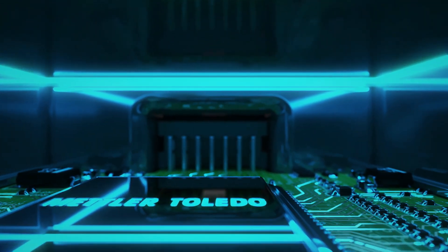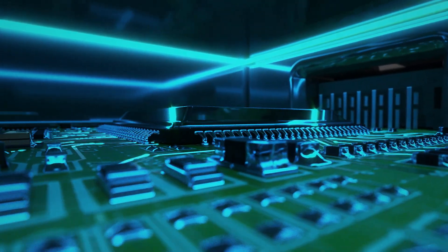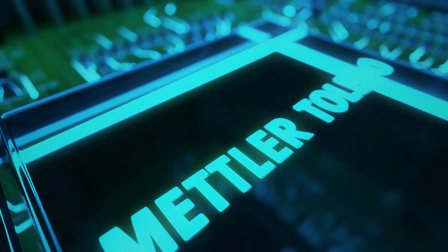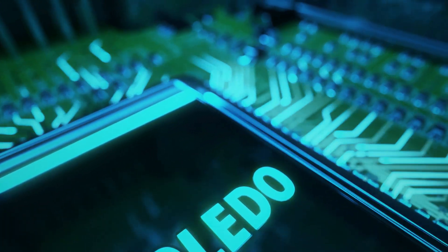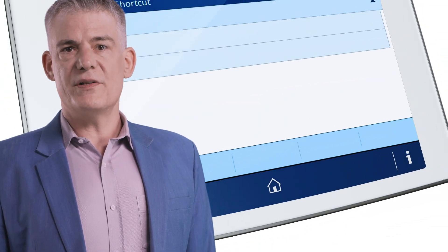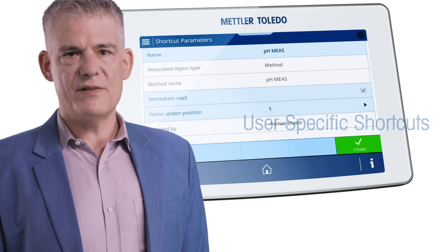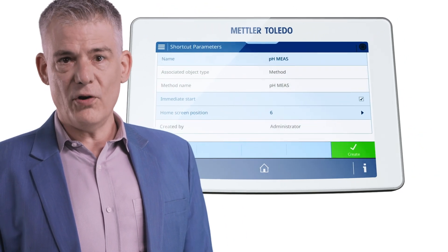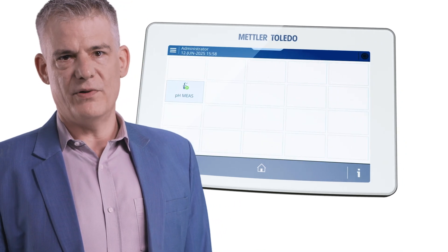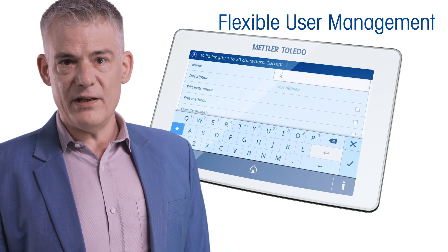At its core, 9Focus is a powerful mini-computer. The sensor bridge converts raw analog data into digital signals, ensuring accuracy and full data traceability even across a distance. We know lab work is demanding, so we made sure 9Focus doesn't slow you down. User-specific shortcuts ensure a simple and quick start of any — however complex — workflow directly from your home screen. To protect the settings from any unwanted change, we have fully flexible user management.